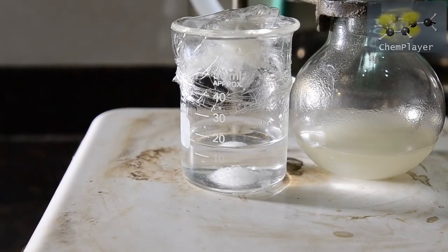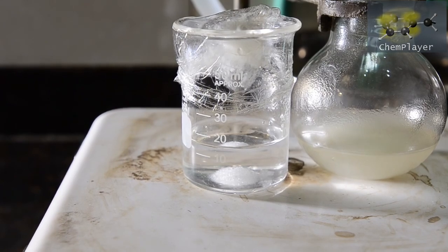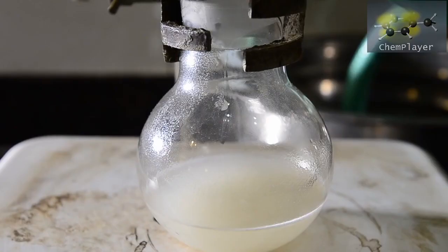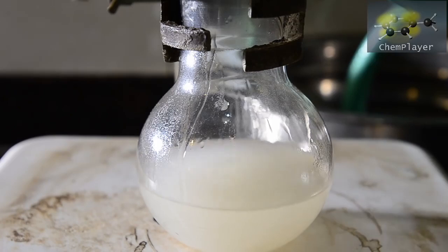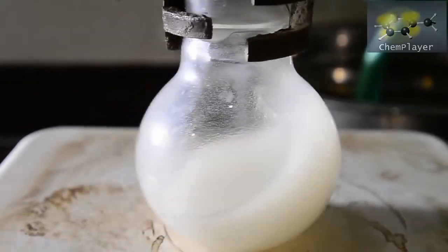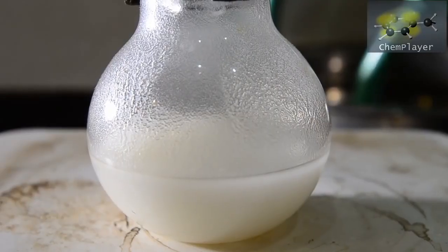And now we're just waiting for the urea to dissolve in the ethanol. At boiling point, that's all dissolved. And now our urea solution in ethanol goes into the reaction flask. Within about 10 seconds a white precipitate starts to form in the flask, and this becomes quite thick.